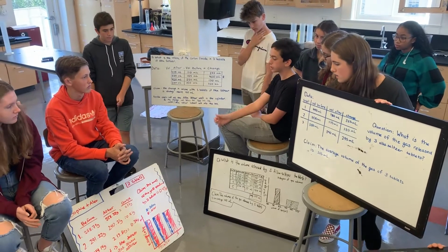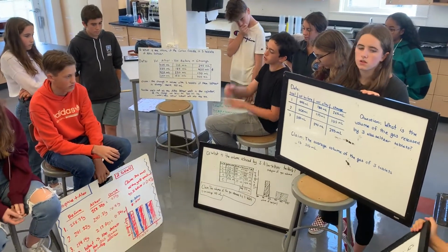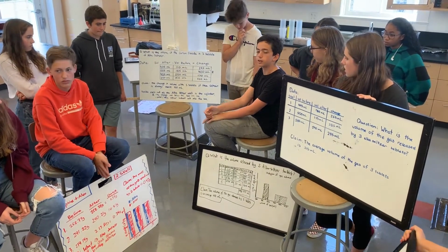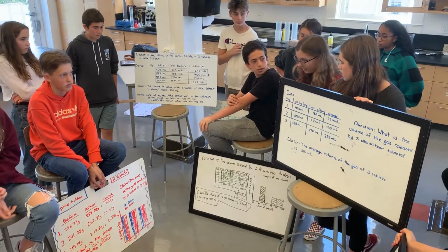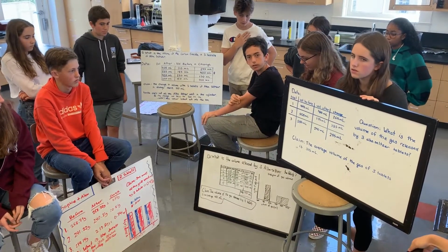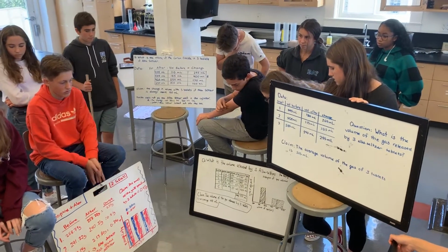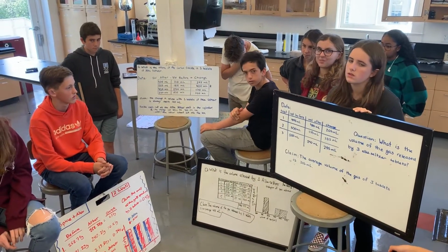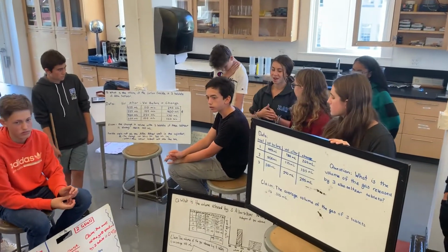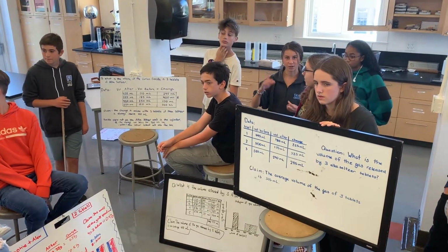There were a couple times where we couldn't get the Alka-Seltzer under the graduated cylinder as quickly as we would like. And then our claim is the volume of the gas released by 3 Alka-Seltzer tablets is about 441 milliliters.